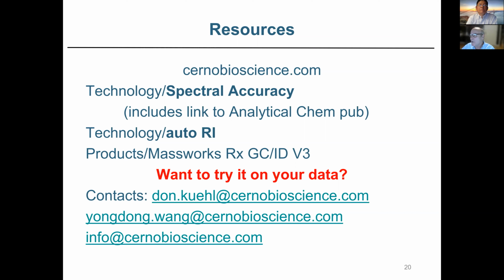People spend weeks with very powerful tools to try to do that kind of thing, and ultimately to confirm it, they wind up synthesizing the compounds. So it's not particularly easy, but you do have a start. For example, if you could be confident of the molecular ion, you might have to run CI to do that. You can go to something like ChemSpider and look at the logical structural candidates. And then there are tools that will help you analyze what the fragmentation patterns are for those structures. So it gives you a start. It definitely can help you out.